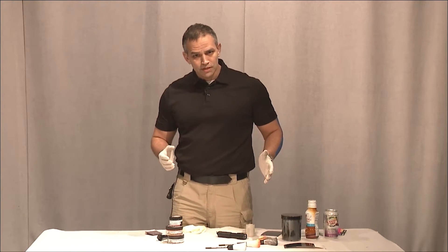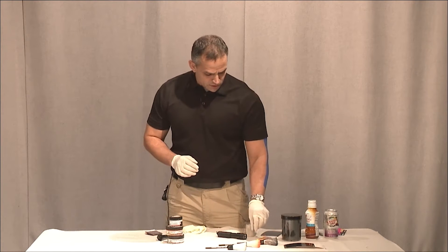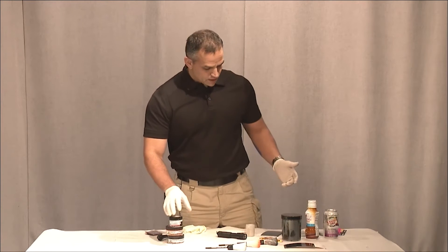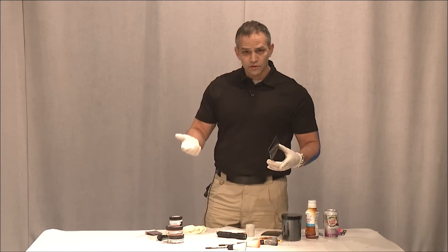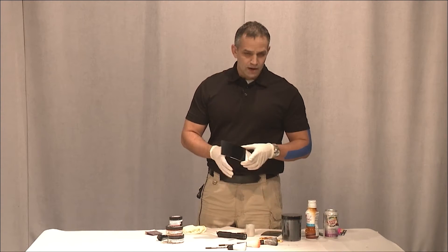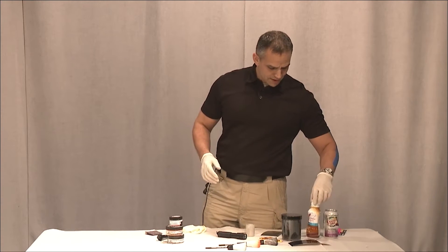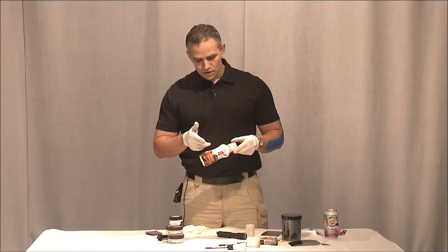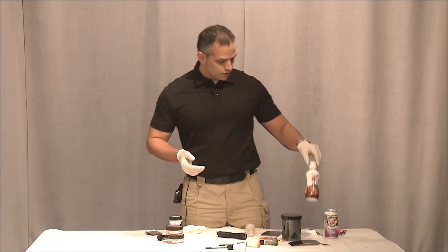Sometimes when we're on a crime scene and you're dusting for fingerprints, you're going to have an object that has both light and dark. We know if we're dusting something that's black, we'd use a white powder, or if something's white, we'd use a black powder. That's simple enough, but I have a couple of objects here where there's both colors — a dark color and a white color. So I'm going to show you a dual-use powder.